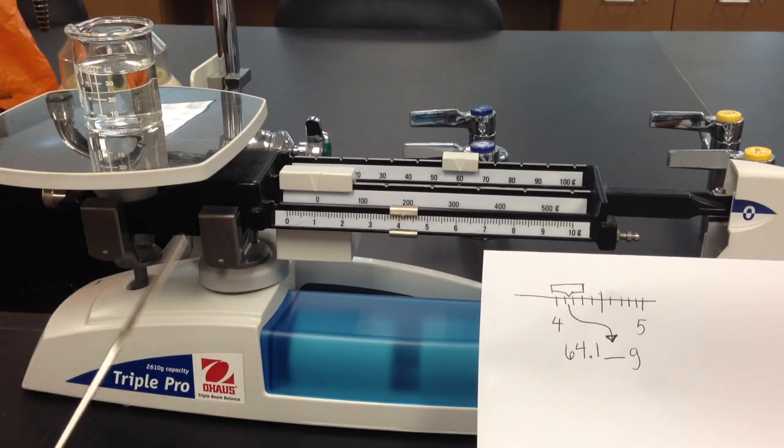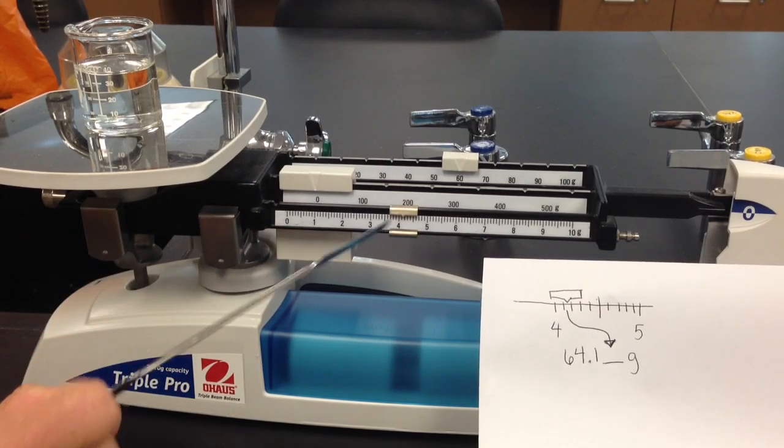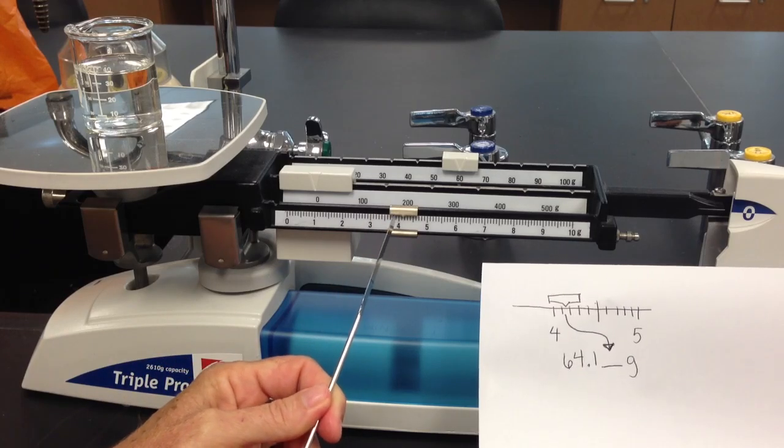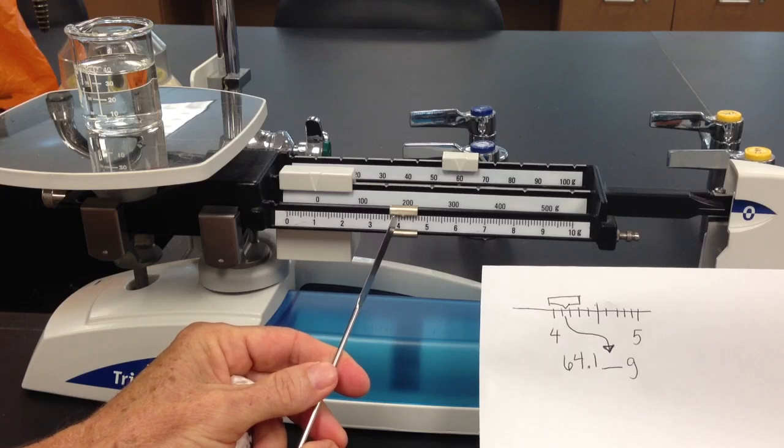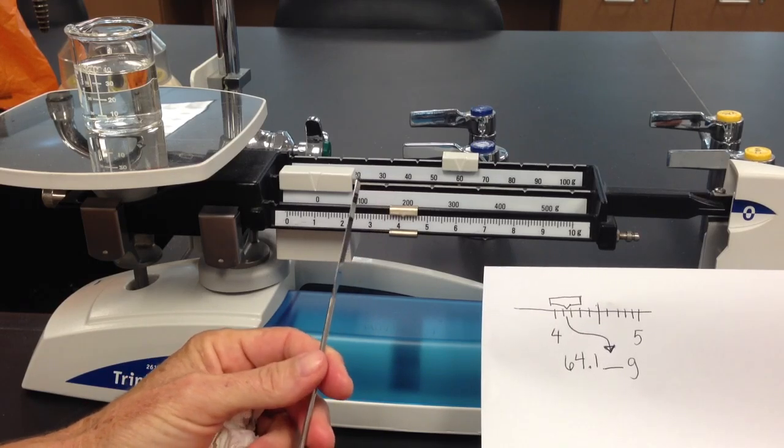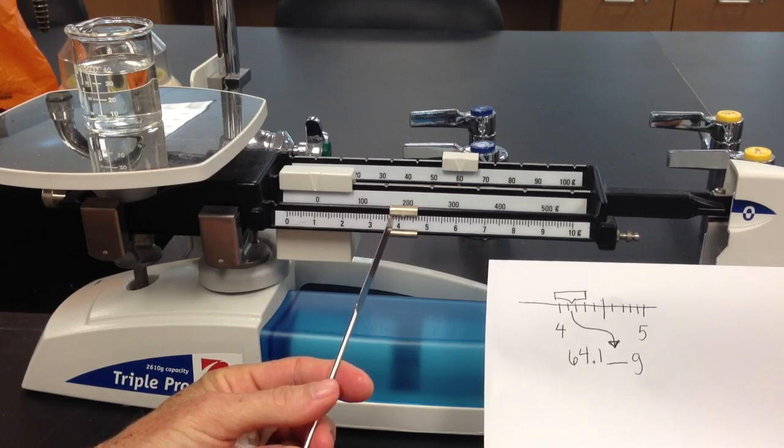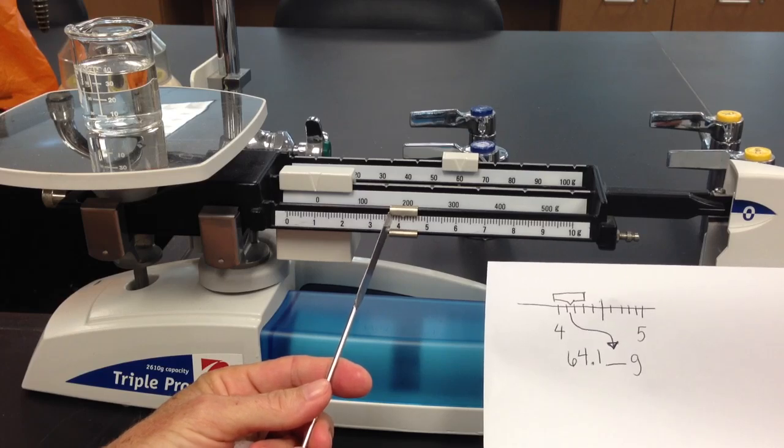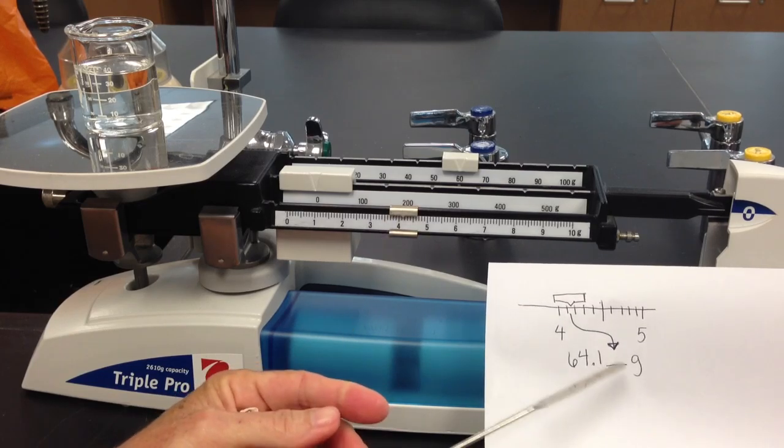Now we're going to determine our mass. We have 60. 64 is our second certain digit. Our next certain digit is 64.1, and we need to estimate our last digit—that will be up to you, the observer. Try to get your eye right in front of where you're reading your mark, and we're going to say that this beaker weighs 64.16 grams.